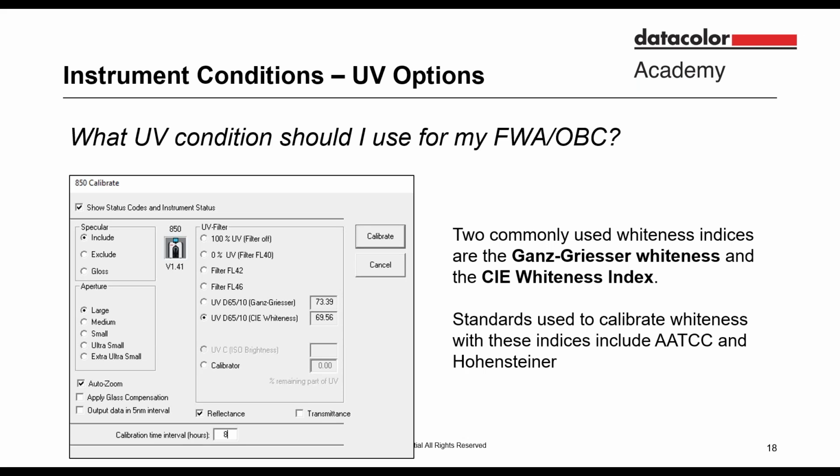What UV conditions should we use? Should we calibrate our instrument for UV? Should we include UV? Should we exclude UV? In general, many brand programs recommend measuring color samples with UV excluded.